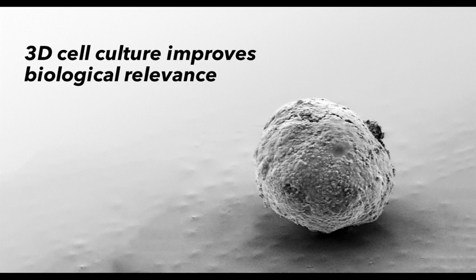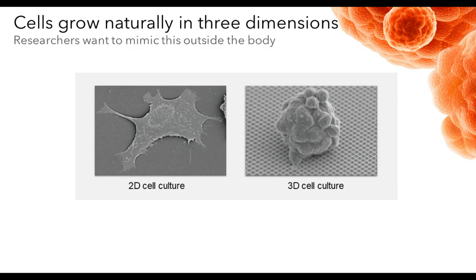Now let's focus on three-dimensional cell culture, because the goal here and the theme I'm developing is that one wants to look at cell culture techniques and cells themselves where they have improved biological relevance. That's important in disease modeling. It's very important in terms of looking at the pharmacological action of drugs. And growing cells in 3D culture enables one to take a step in that direction.